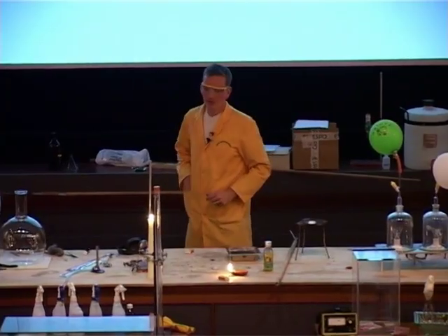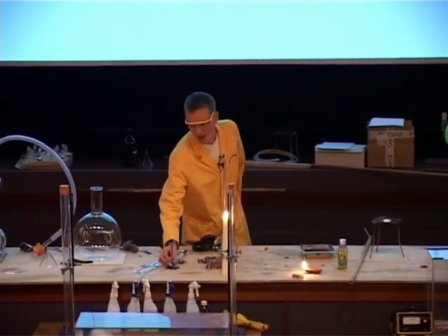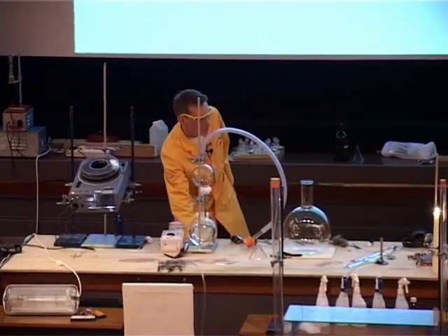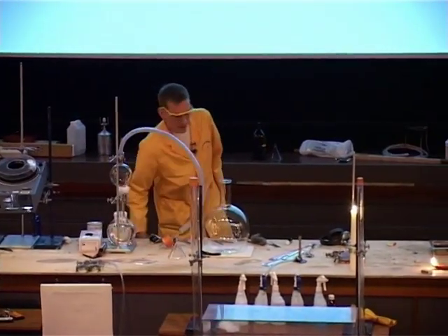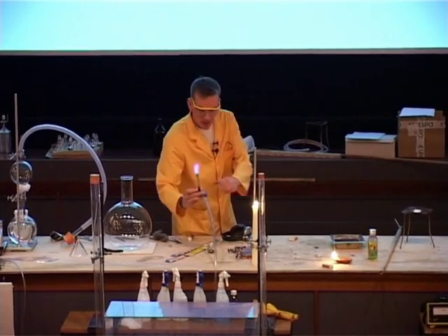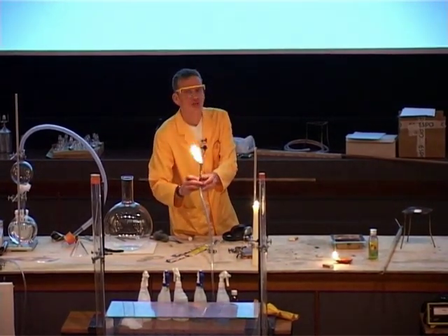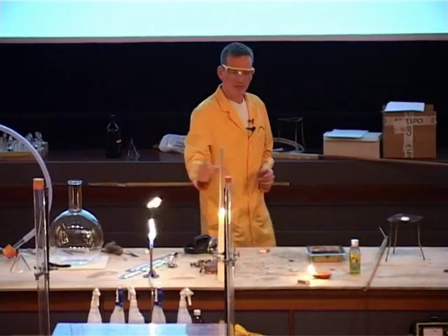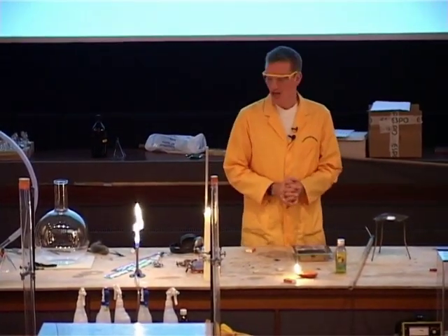Okay. These are the fuels we're seeing here, the fats: carbon, hydrogen, and maybe a little bit of oxygen. Well, some fuels contain just carbon and hydrogen only. So if I turn the gas on here from my Bunsen burner, this fuel is a hydrocarbon and consists only of carbon and hydrogen. And we see that this gives out a lot of light as well. Very nice.